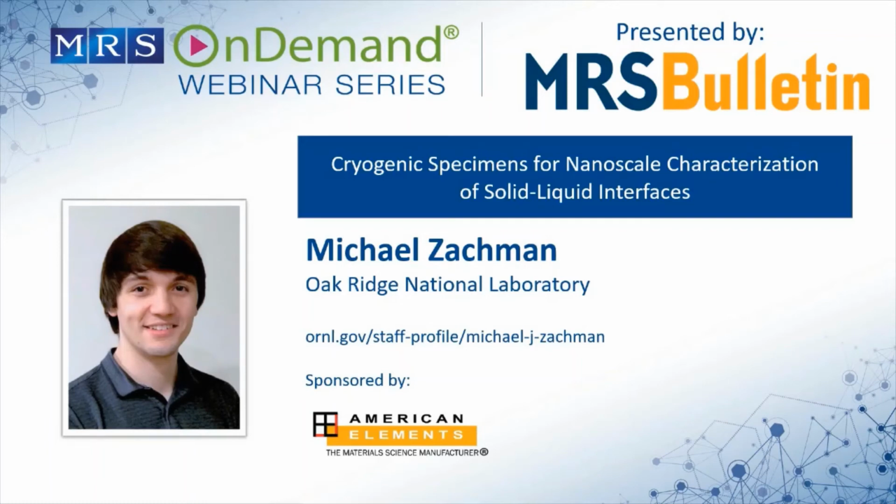And if you remember the reaction that I showed that's consistent with our EELS data, it was going from the ethylene carbonate in the electrolyte to a lithium ethylene dicarbonate. And the byproduct of that is ethylene gas. And so right on the surface of the lithium, you'd be producing ethylene gas, and some of that would become trapped in the SEI potentially and leave these bubbles. And then also some of it's floating around in the SEI.